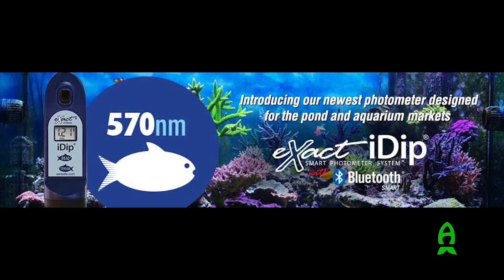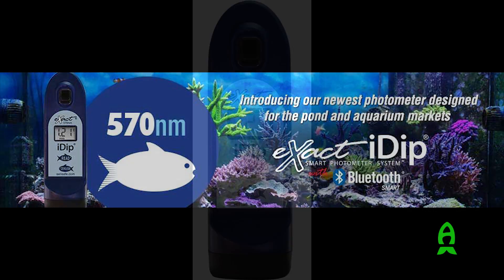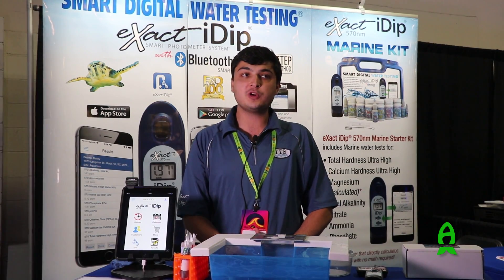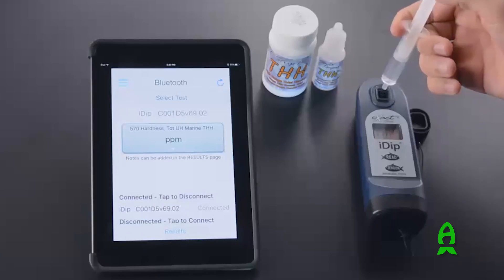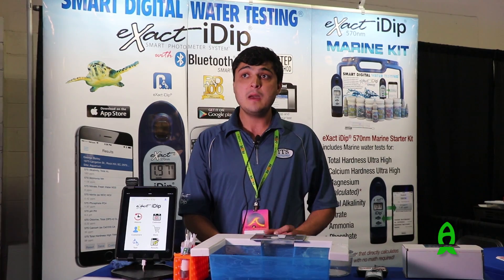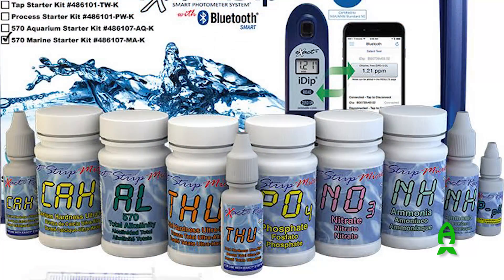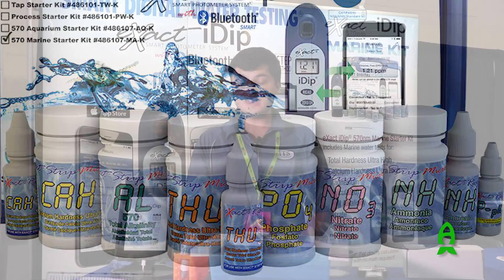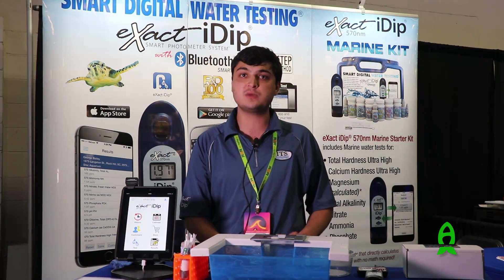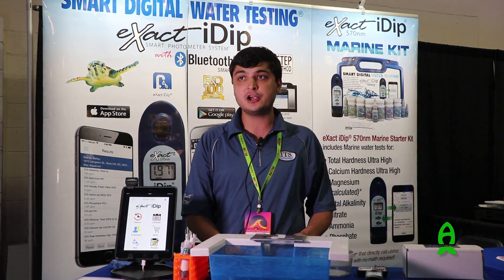Today I'm here to talk about our marine 570 nanometer photometer. Our photometer is basically made for the consumer to get all their water quality testing done in the easiest and quickest amount of time possible. It tests for alkalinity, pH, calcium, hardness, magnesium, ammonia, nitrate, and phosphate. There are many other parameters not included in the kit that it can also test for, such as copper, iron, and metals.